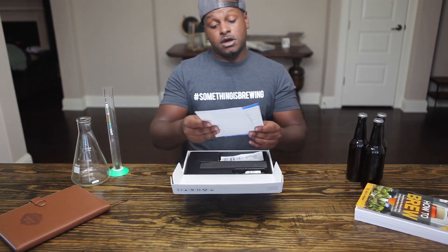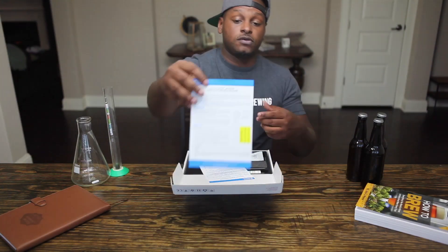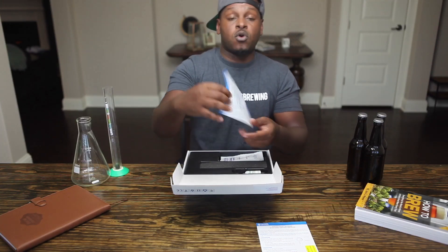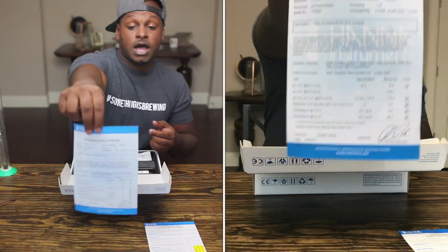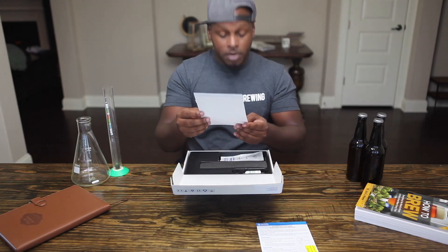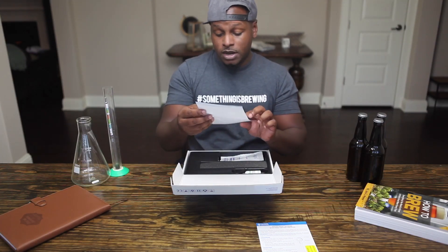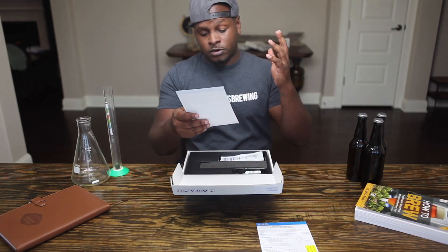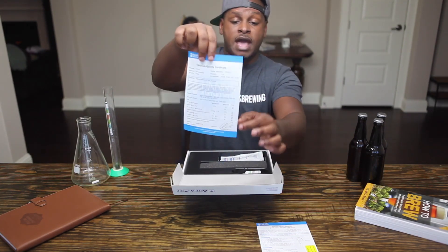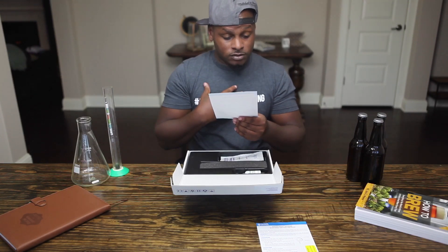Now that we got this box open, it comes with a quick start instruction guide, which is very helpful whether you're new to pH meters or experienced. It also comes with an Electro Quality Certificate — hand signed by the production manager and also signed by the inspector. They tested it across the 4.01 to 7.01 pH range at temperatures from about 60°F up to 175°F, and everything got passing marks. Seems like they thoroughly tested this unit.